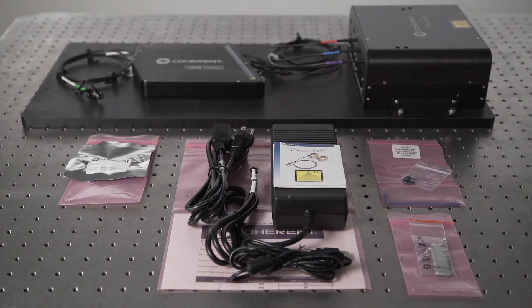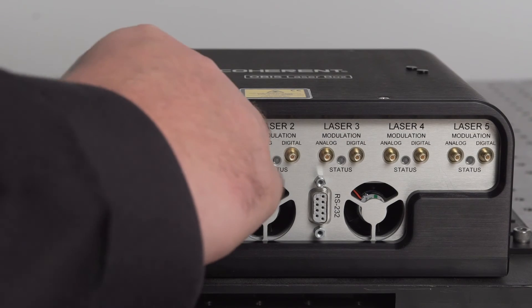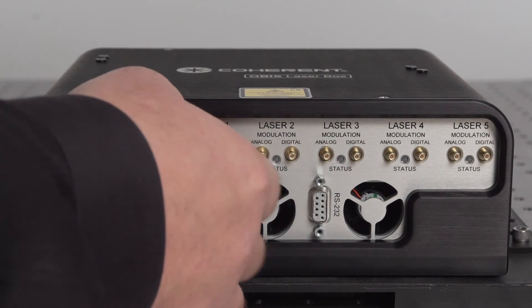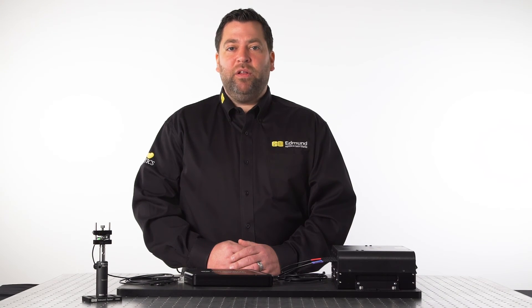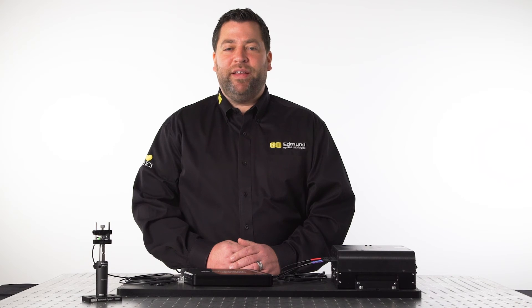Upon receipt of your laser system, you will find that there are very few components required to get the system up and running. Simply plug in the DC power supply, insert the safety interlock, the key, and connect the system to a computer via the provided USB cable. Once all status indicator lights are green indicating that the lasers have gone through their startup cycle, simply turn the key and your system is ready to go.